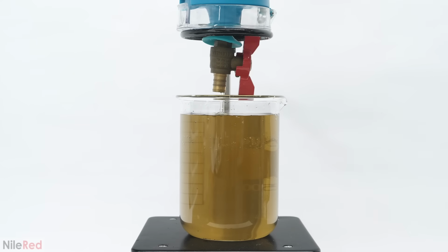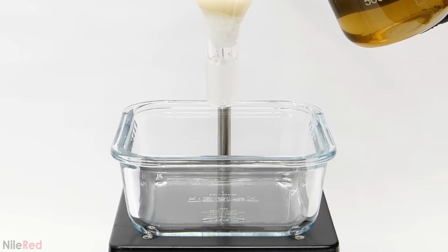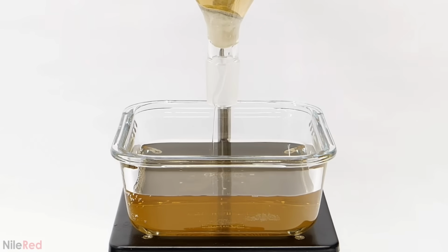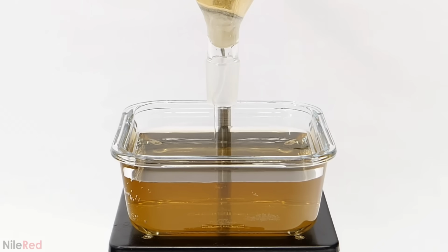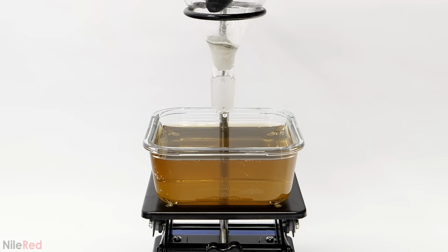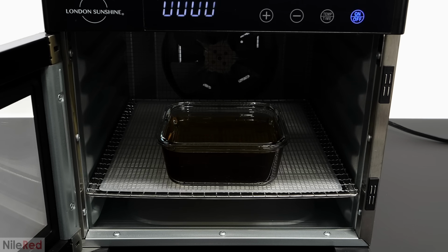The only thing that I didn't like was that it looked a bit cloudy. To fix this, I tried pouring it through some cotton and Celite, but I don't think that did much of anything. In any case, what I had now was still way better, and it no longer had a weird smell. It basically just smelled like water, and it also wasn't acidic. The only issue was that there was still way too much water, so I put it back into the dehydrator.